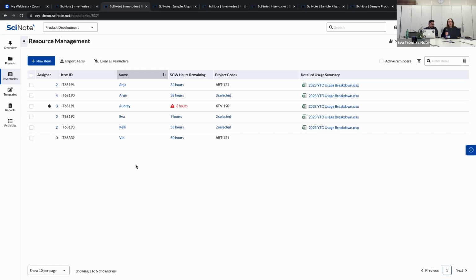And then you can set a date for open date. That way, the day that the bottle is open, or whichever bottle is open, you can set that date. And then if the bottle expires 30 days from the open date, you can set the expiration date accordingly, and then set a reminder to let you know within 5 days or 10 days of the expiration date approaching. If you need some additional help with this, please go ahead and email us or email your CSM, and then we can help you set it up more tailored to your specific use case that you have.